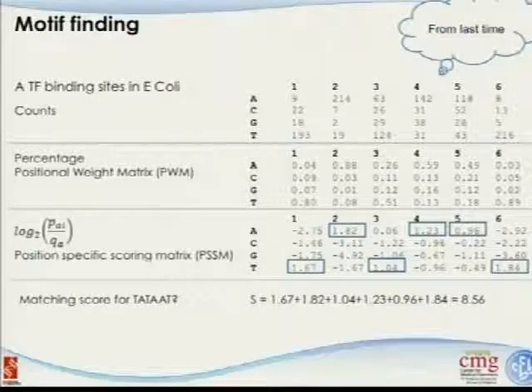We also talked about how we can transfer this to something called position-specific scoring matrices, which is just another way of calculating things. And once we get a new sequence, like a 6-base pair, based on this position weight matrix, we just check the numbers inside and add them together, and that gives you a calculation for the matching scores.